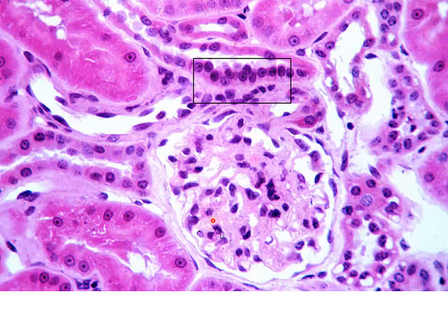that we can see in our field here. These are our capillary loops. Now, mixed within this glomerulus, we're going to have some intraglomerular mesangial cells. We can't really pick them out adjacent from our endothelial cells of the capillary, so we're not going to do that in lab. But on the very outside, when you see nuclei on the very outside of this particular structure, that's going to be our visceral layer of Bowman's capsule. Those are going to be our podocytes. Here we can see one as well. Now, these epithelial cells lining this outer portion, this is going to be the parietal layer of Bowman's capsule, and this is going to be Bowman's space.